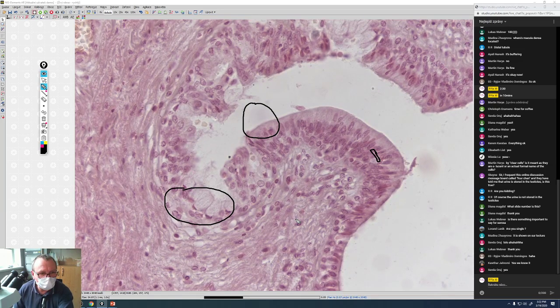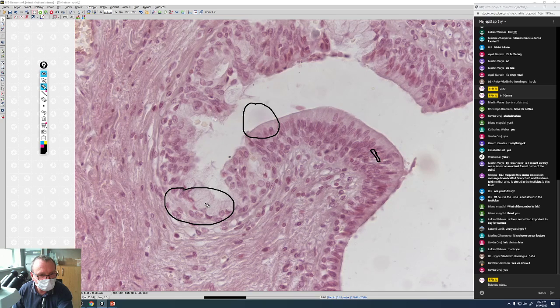We can see granules, light, translucent granules, and these groups of mucous cells in the epithelium are special intraepithelial glands, which are called urethral lacunae, urethral lacunae of Morgan.